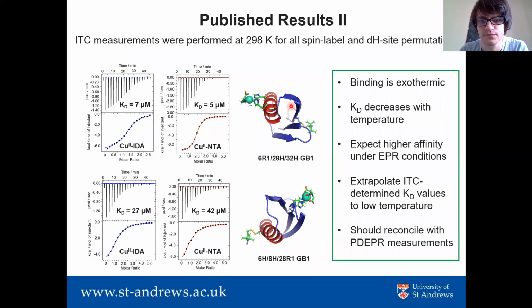Yep. So maybe I start with the first question. That's a really good point. I can only speculate, because to my mind there aren't enough generic widespread applications for this that would paint a definitive picture of having, say, high affinity for all double histidine motifs on a helix or all double histidine motifs on a sheet.